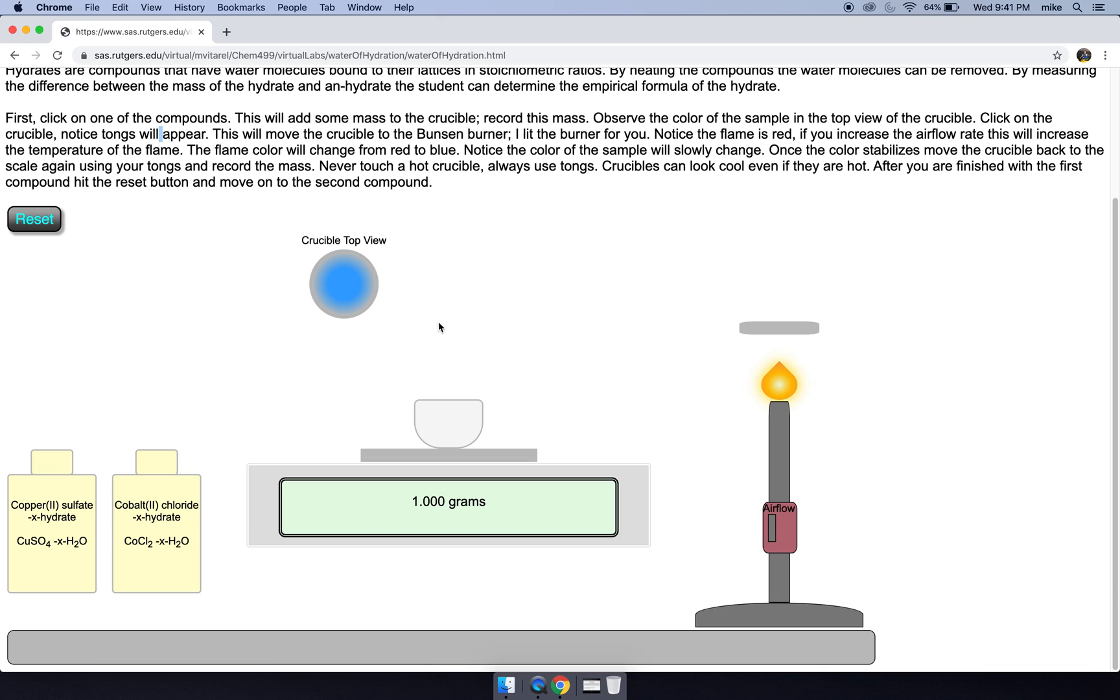Now notice if I mouse over the crucible, my mouse pointer turns into tongs. So in the lab you would always use tongs to move your crucible. You should always assume that if you're using a Bunsen burner with a crucible that the crucible is hot.